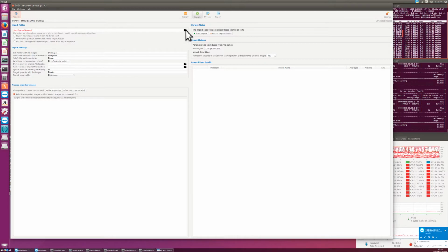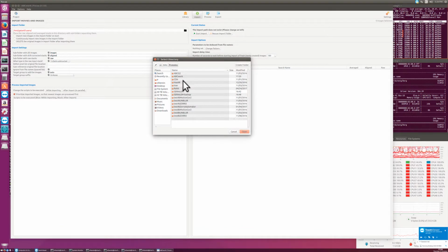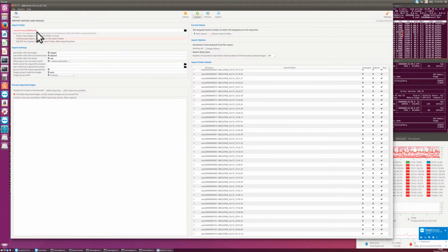But for this project demonstration, as I said before, we do this locally, and we say we have here a OEM computer, and I just go to the OEM basic directory, and in there we have this raw folder, for example here, where all the TIFF files are.